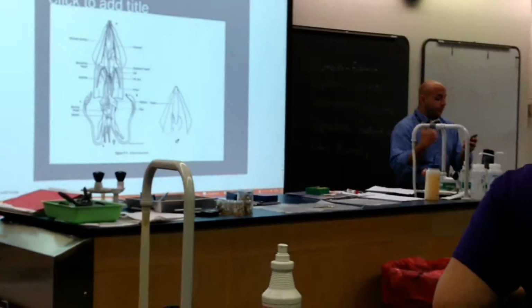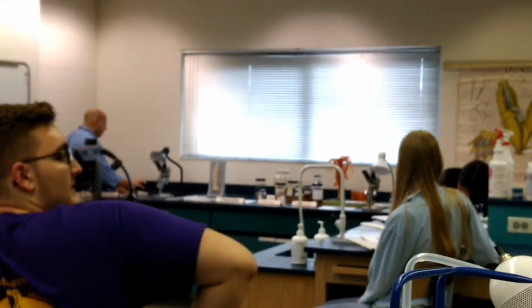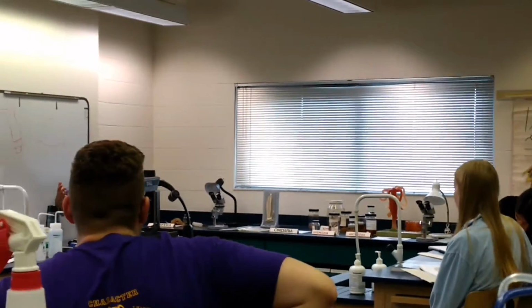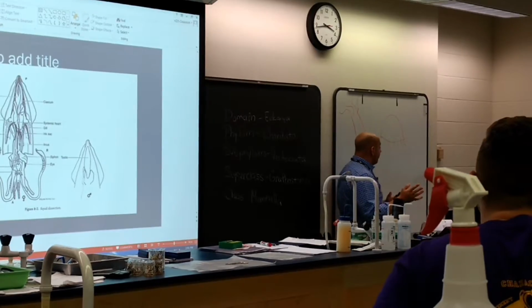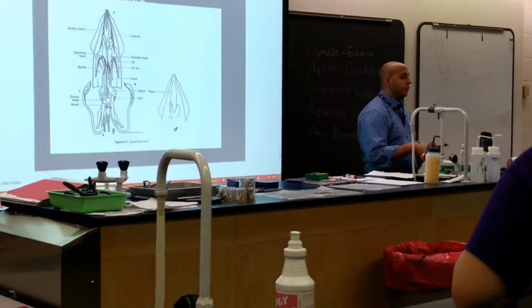I also have 3 sponge representatives for you guys to look at here. And I want you guys to make sure that you know a little bit about them. You know what phylum they're in. You know what domain they're in. If I ask you domain, everything is in domain Eukarya, so I'm right there. But you need to know body symmetry, a few different things like that, okay?